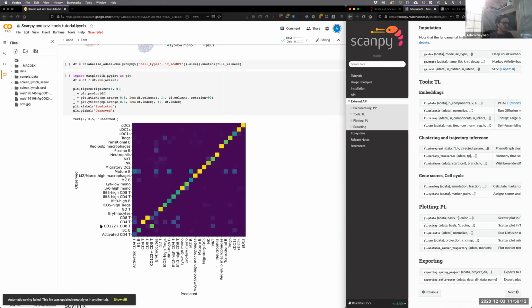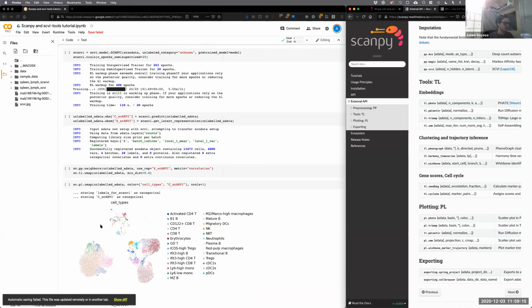And to run it, it's quite similar to running scvi. That's one of the things about scvi-tools: it's pretty consistent across models. Like, if you get CITE-seq data that has protein data with it, it's a very similar API, you just run a different model. So in that sense, it's like scikit-learn.